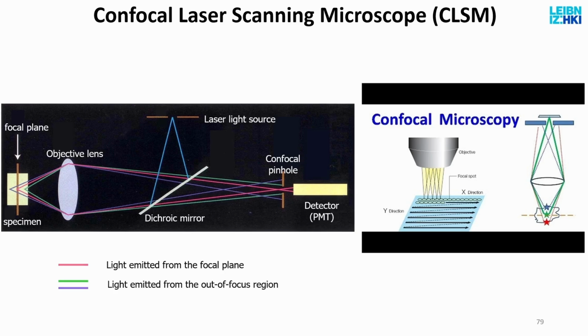Disadvantage, I lost a lot of light. All the light that did not come through the hole. Those photons hit the metal plate. But I get a sharp image in the sense that I'm only getting an image from, let's say, 1 micrometer away. What did I do? I sliced the sample optically.